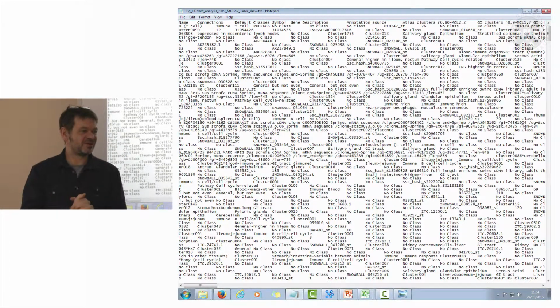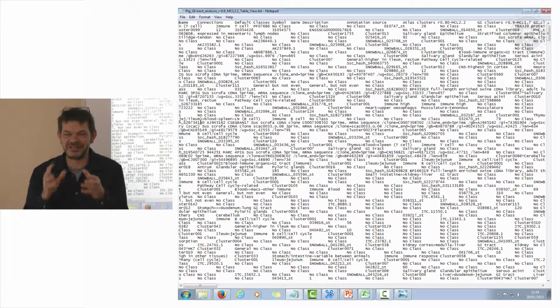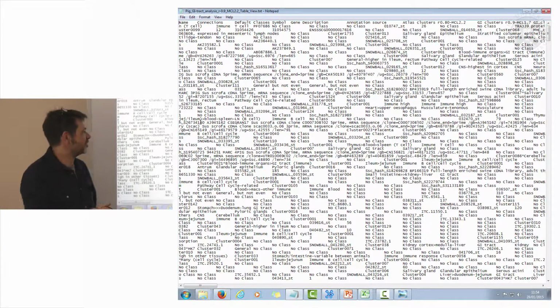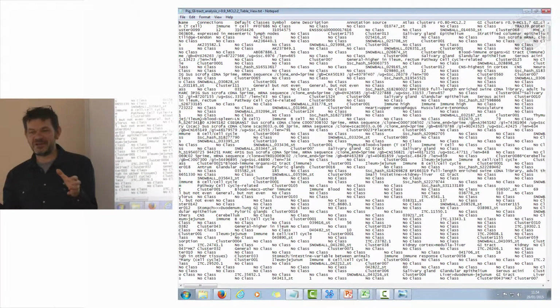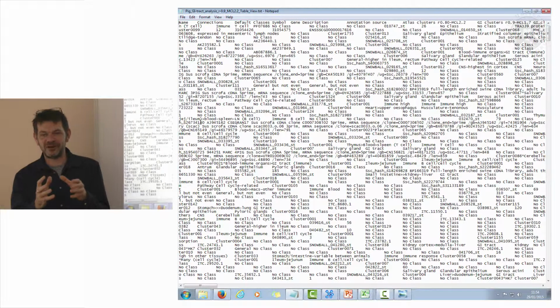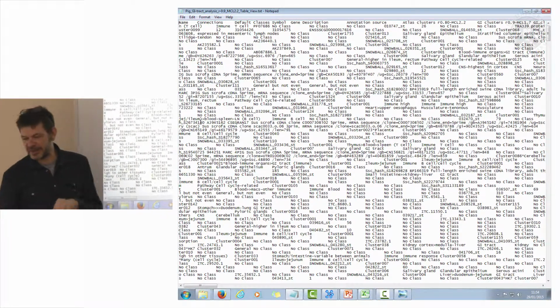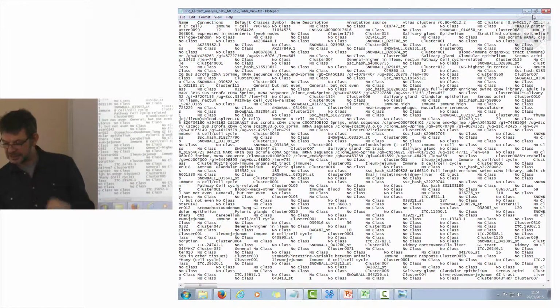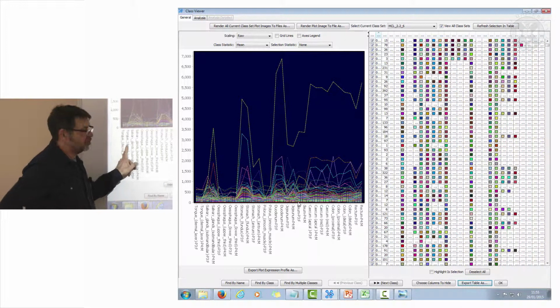That might make some people uncomfortable, but the reality is there's a statistical improbability that these things are going to be together. After looking at hundreds of data sets, I can tell you that if the experiment was good, you'll get a great biological enrichment within that. Okay. The other thing to mention about just looking at data in this way, you want to use all your data.